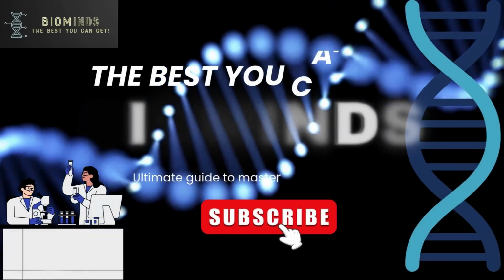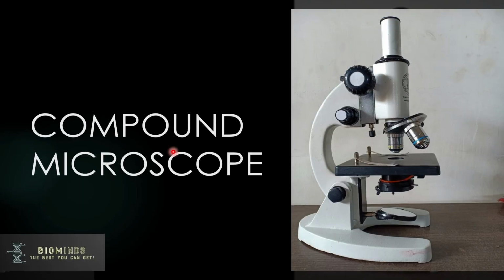Let's get started. So today we will learn about the compound microscope. The microscope is one of the great inventions of science, as it can help in finding or observing the little things which surround us, and it is very important in microbiology, biotechnology, molecular biology, etc. So we will learn about the compound microscope, which is the very common microscope we use in the labs or in the college labs as well.